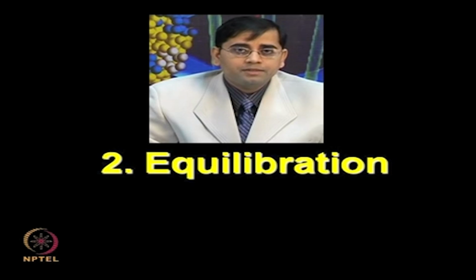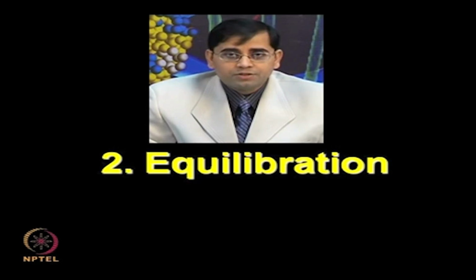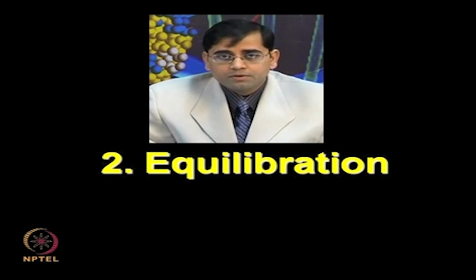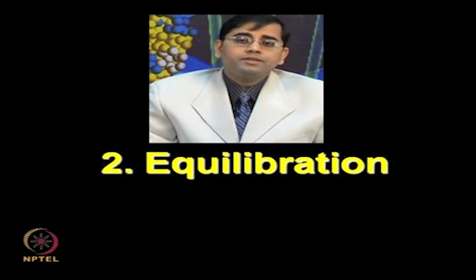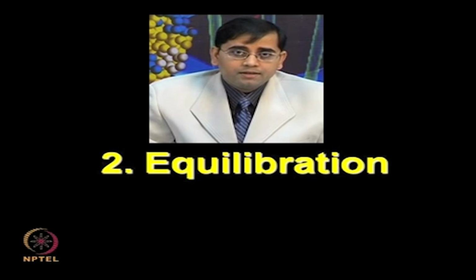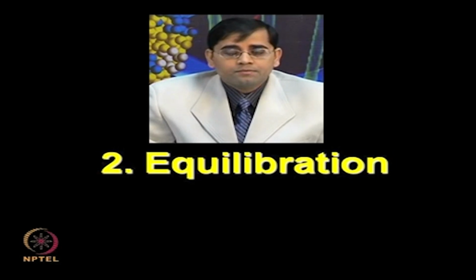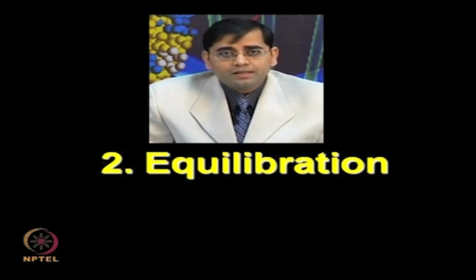As I briefly described in the previous lecture, once you have performed the isoelectric focusing or IEF, you need to prepare your IPG strip for the next step, which is SDS page. When you are doing the conventional SDS page, you pour the gel, both resolving and stacking, then make some wells by using a comb, and then load your protein samples in different wells.